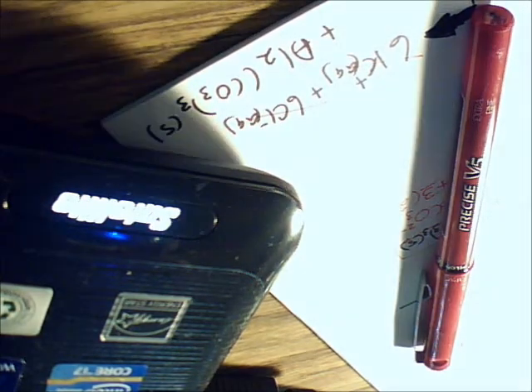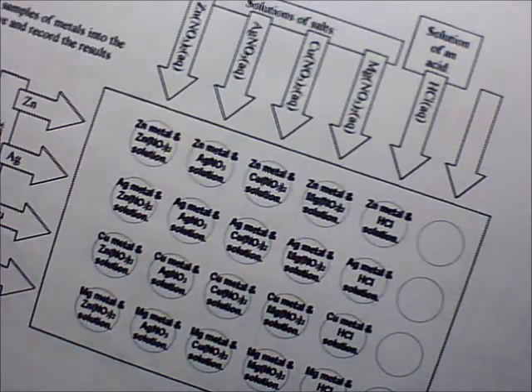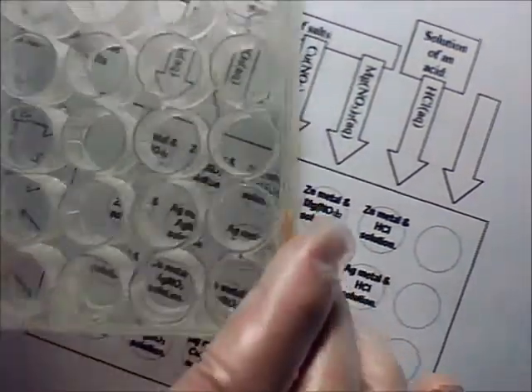Okay, let's talk about what you're going to be doing in the lab now. Was that sodium metal? That was sodium metal. All right. On your lab tables, when you get back there, you've got a basket that contains one of these well plates.